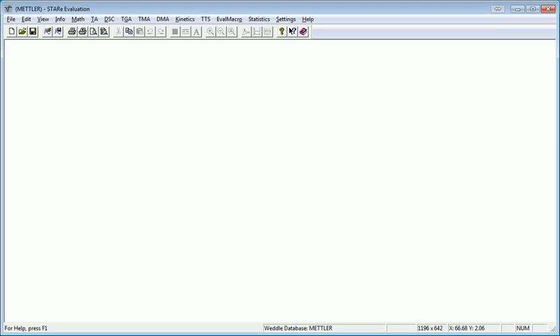Hello, I'm going to make a video showing how to do some basic evaluations of a curve generated with the Topham software from Mettler Toledo.